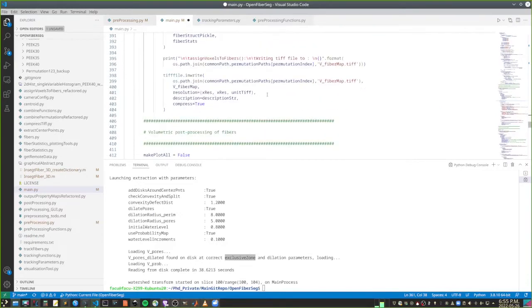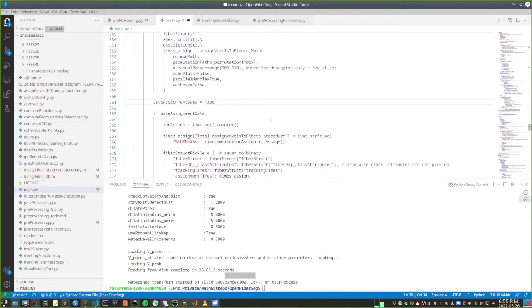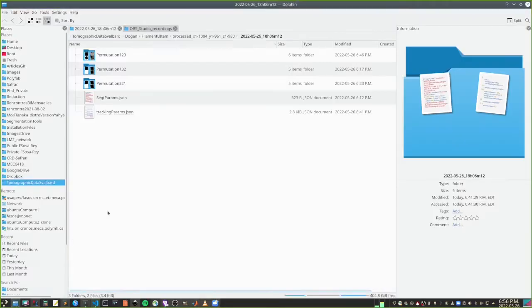Okay, so what else? I think we've covered most of it. After this step, it's going to take a long time. For this scan, I think it took like 7 or 8 hours last time I used it. What will be the output of this scan? Do you have some files to show us? Yes.